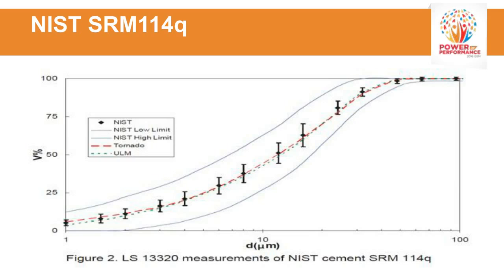And so this shows quite good agreement between both wet and dry. As long as you can, and cement typically disperses pretty well, both in a wet and dry state. So when there's no problem with dispersion or stickiness of materials, wet and dry should agree with each other similarly like this. And this shows the quality of data you can expect from the LS for running cements.